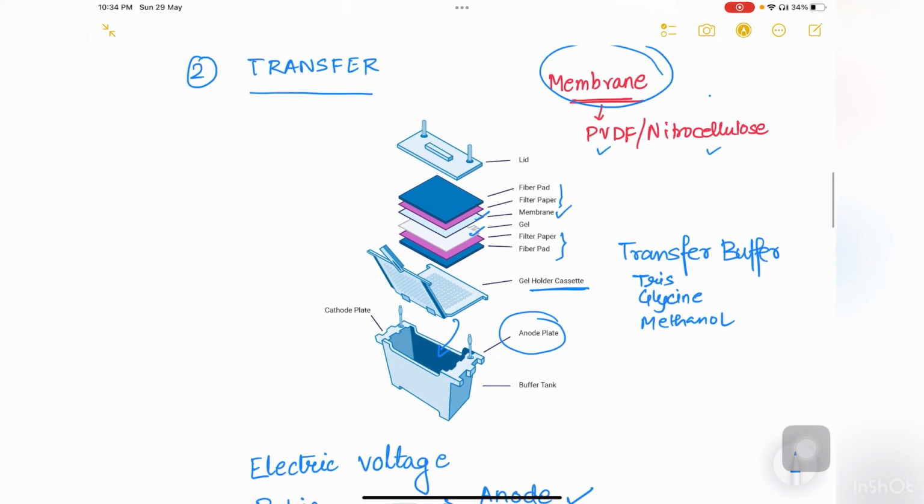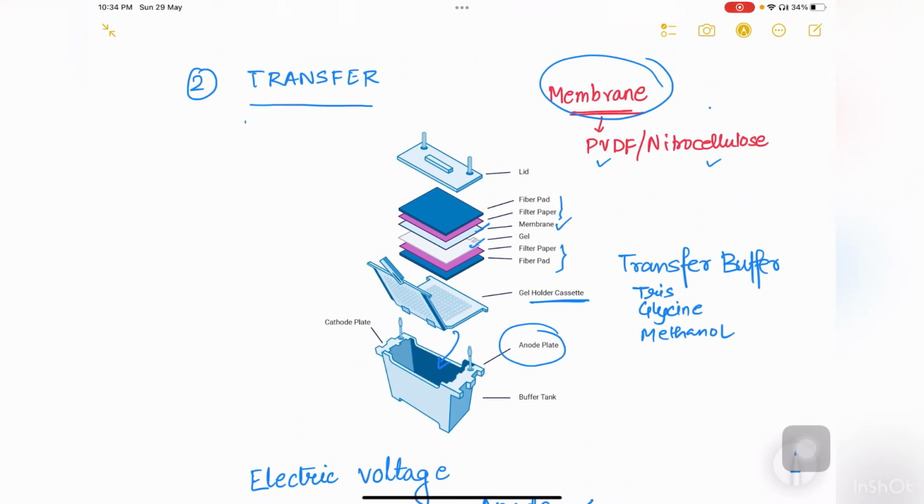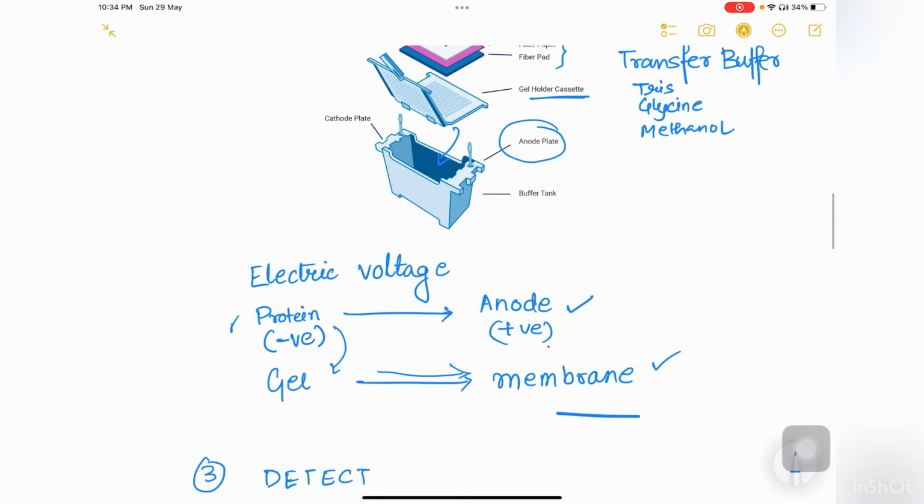So this process is actually a wet transfer method. There are several other transfer methods like dry transfer and semi-dry transfer. The wet transfer is the most commonly used method, and it also takes a little bit more time than the other two methods. So by this process, the proteins from the gel are now transferred onto the membrane.